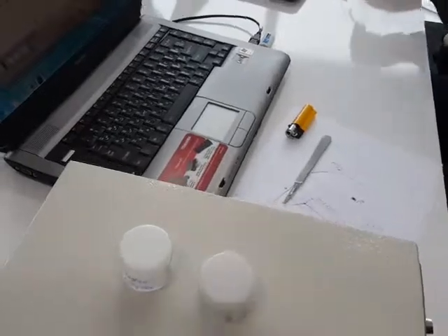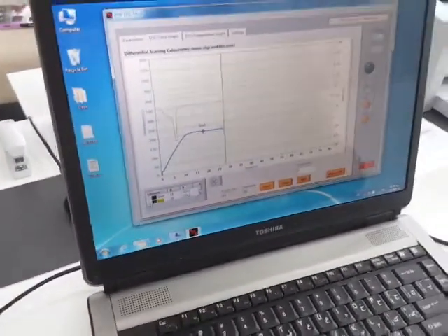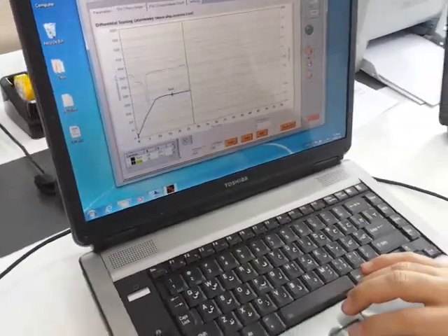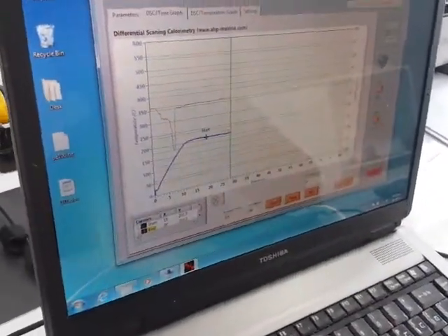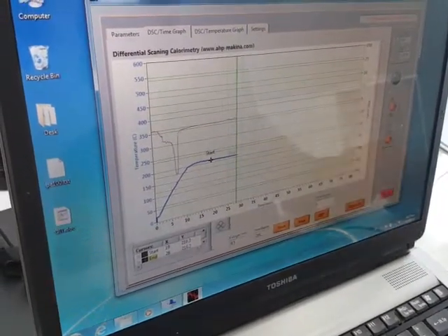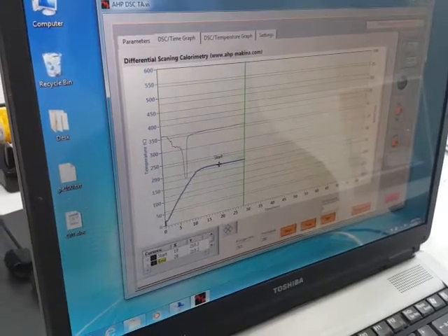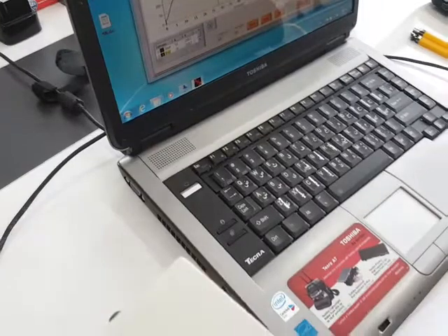For the nitrogen, you will check with the same method. I mean, the operator will open the nitrogen. Nitrogen will be filled in the chamber, and in this case he can use a burning cigarette.